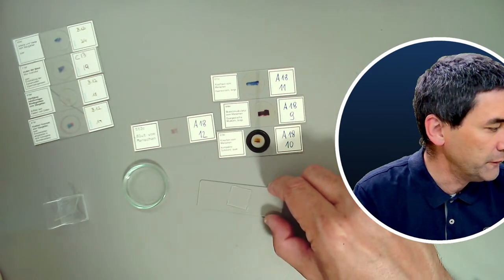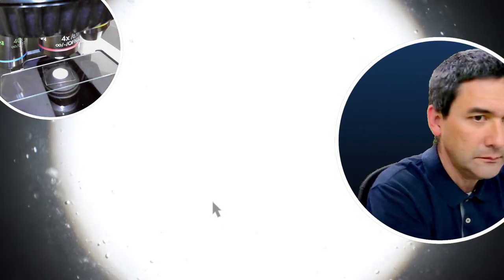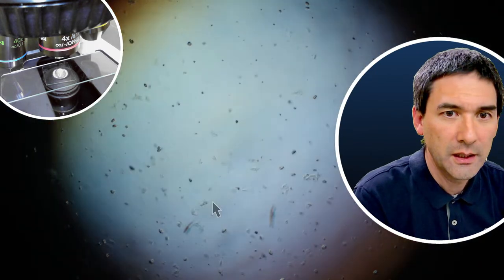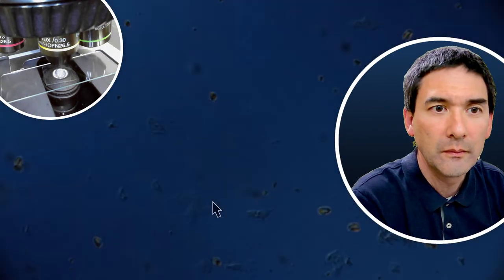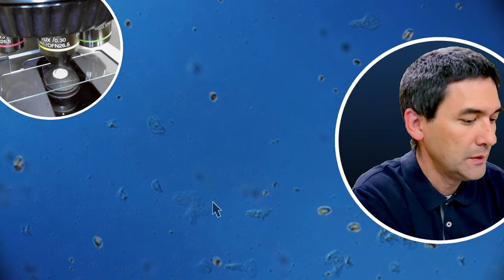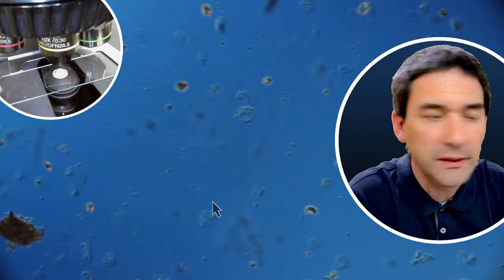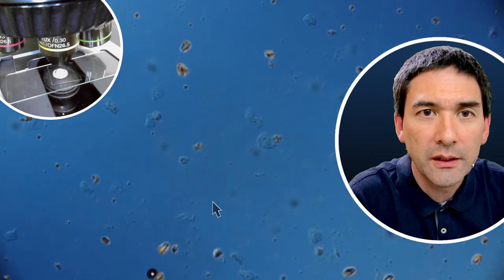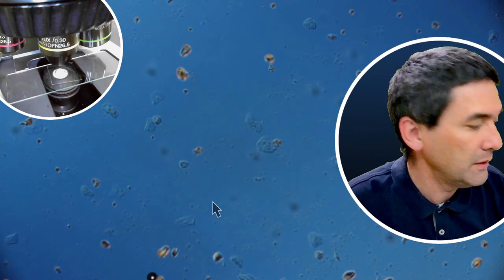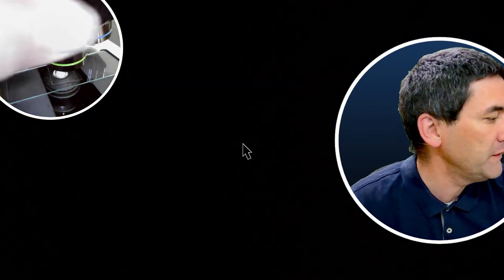And now you will see the difference, hopefully, between a fresh sample. Okay, so let's have a look first again. And this is basically, yeah, we see plenty of cells. Let me see if it's a little bit more dense over here. Yeah, let's have a look now again at the cells. You can see over here, everywhere, still very low magnification.